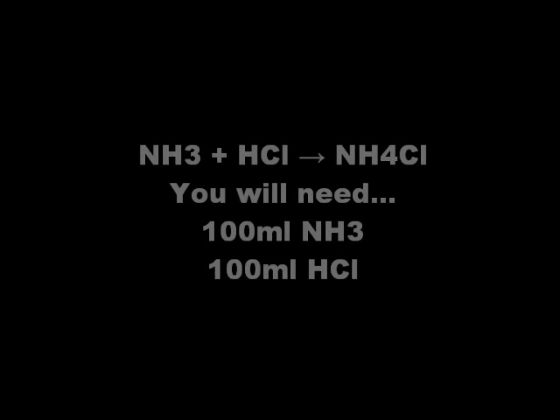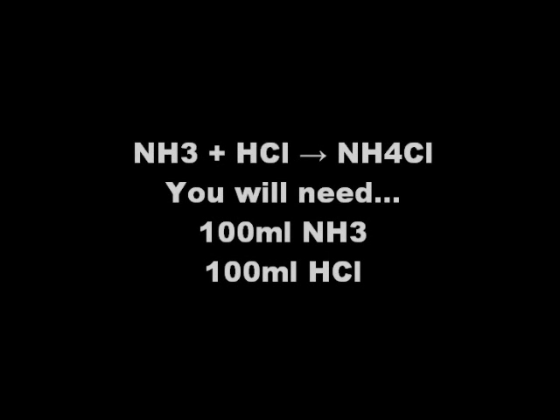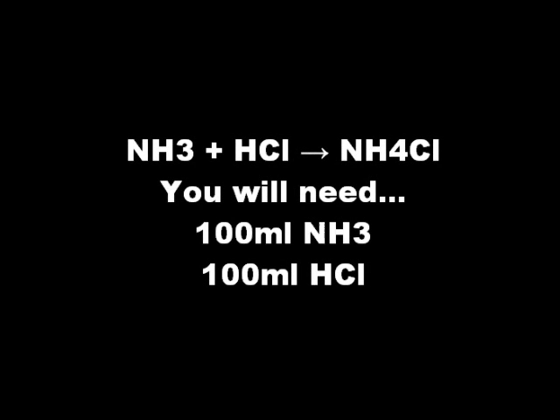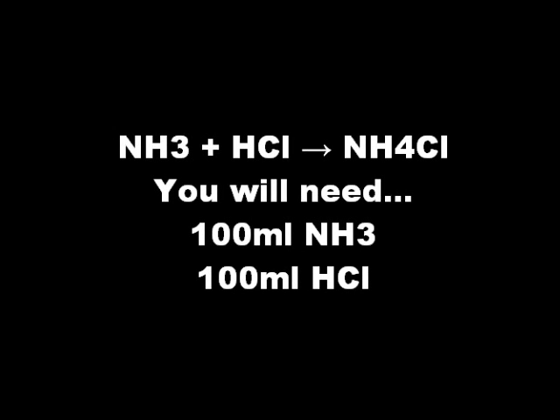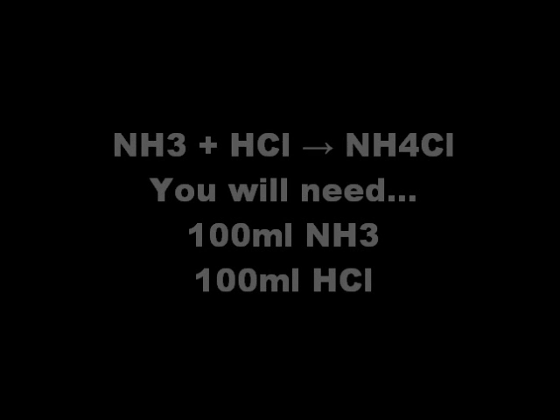For this reaction you will need 100 milliliters of clear ammonia — I got mine from the hardware store. Be sure it's just ammonia and nothing else. Next you'll need 100 milliliters of hydrochloric acid — I picked this up at the pool section. However, the amounts don't have to be exact since we will be boiling the mixture later, which will remove whichever component is in excess.